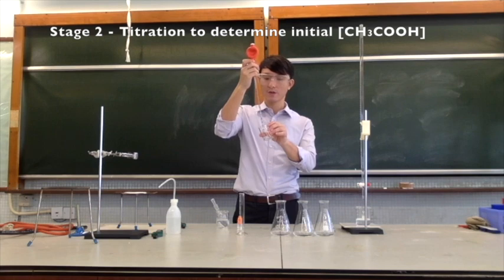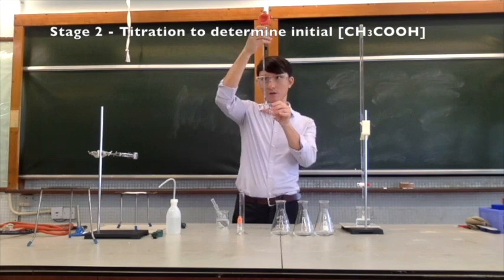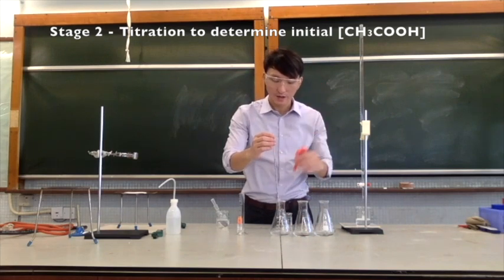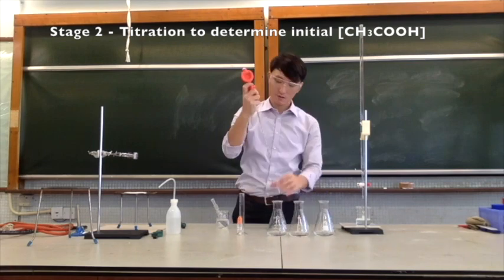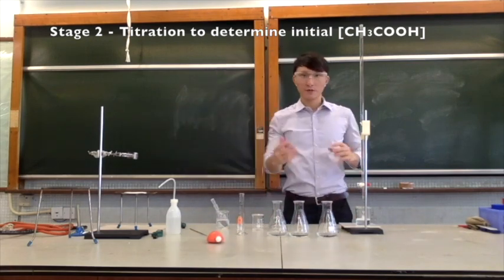Now be careful when you use the 1 ml pipette, the liquid goes up very fast. Now for the micro pipette, it will be best if you take away the filler. So proceed to the titration.